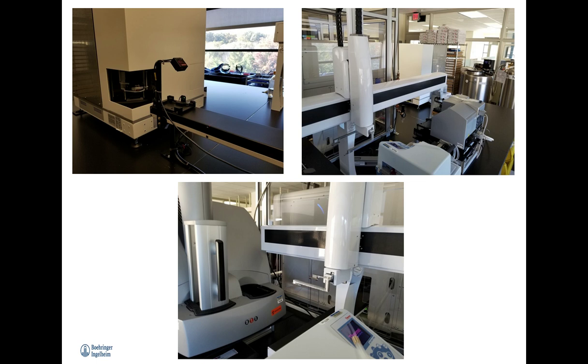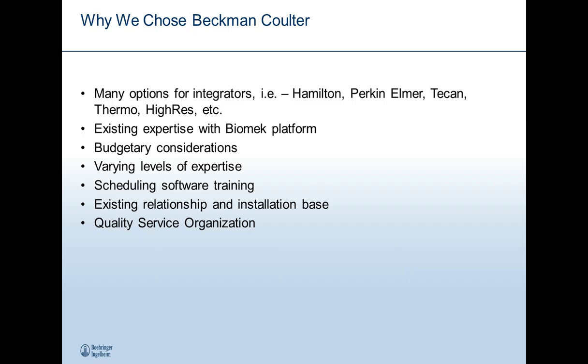And Beckman Coulter was the integrator for this project. What I mean by that, for those who are unfamiliar, is that the integrator is the vendor that will provide the scheduling software and do all of the engineering to make sure that all of the components are able to seamlessly communicate with one another.